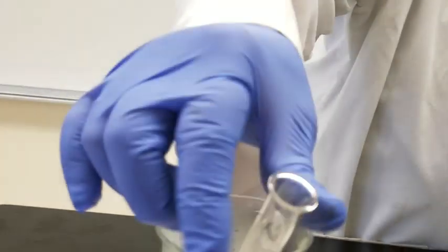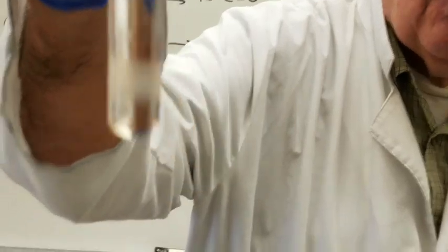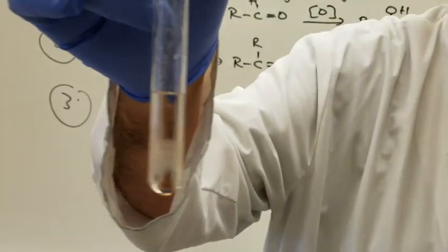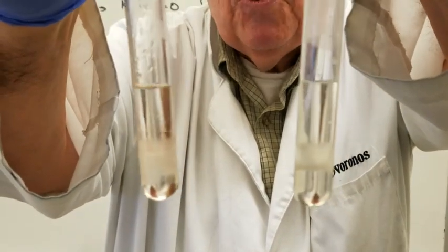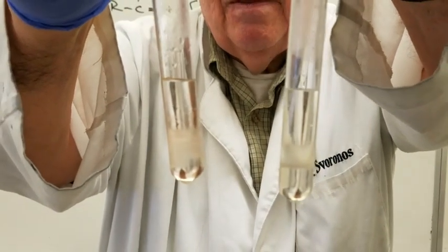The primary one didn't react at all, and again, as we see here, this looks more likely a secondary alcohol. Do we see that? Because it matches more or less this one. So this is a secondary, so our unknown most likely is a secondary alcohol. Okay?